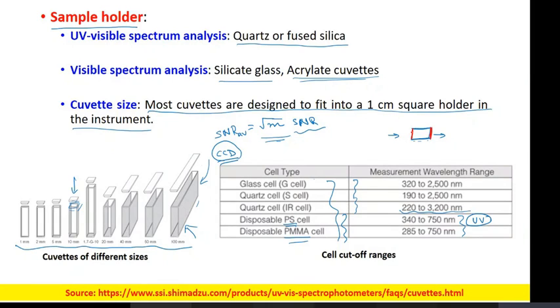If you have studied the anatomy of our body, in our fingers we have small pores through which sebum comes out, which are basically fats. These fats will be transferred onto this region, and you will have fingerprints over it, and you don't want that.